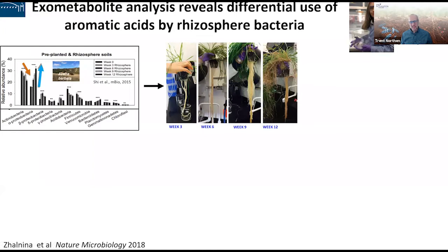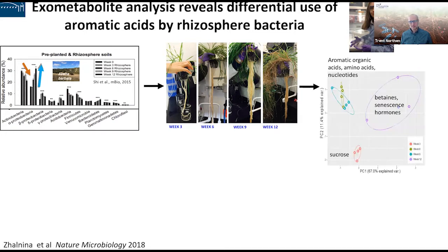And so what Kate did is she collected exudates at each of these same time points here and did exometabolite profiling. And we were interested, first of all, to see if exudates change over time. And in fact, they do.